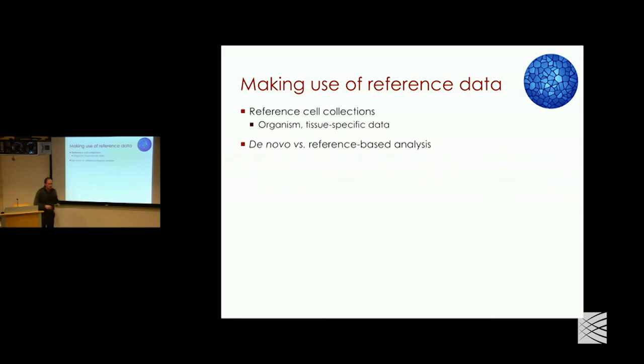So again, moving away from, as I mentioned, I think of these gene sets as a very weak biological prior. And now that we're getting all these nice reference sets, even within our own lab, within the studies we're doing, it's obvious that we can take one data set, and the next time we get a data set, let's say from another patient, we're better off interpreting it using the information we were able to glean and annotate on the first data set. And so we'd like to basically use existing data sets as references.